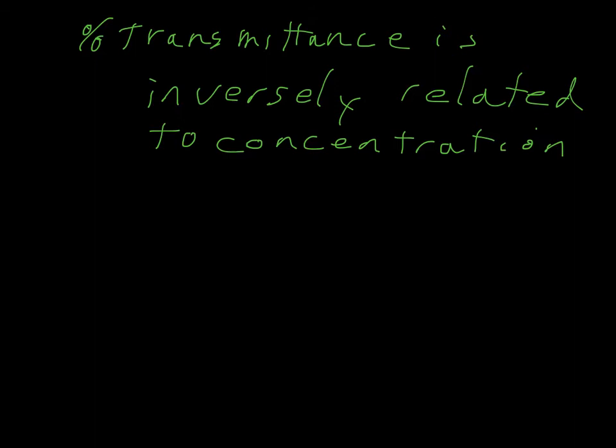Therefore, we're going to play with percent transmittance just a little bit to turn it into a quantity known as absorbance.